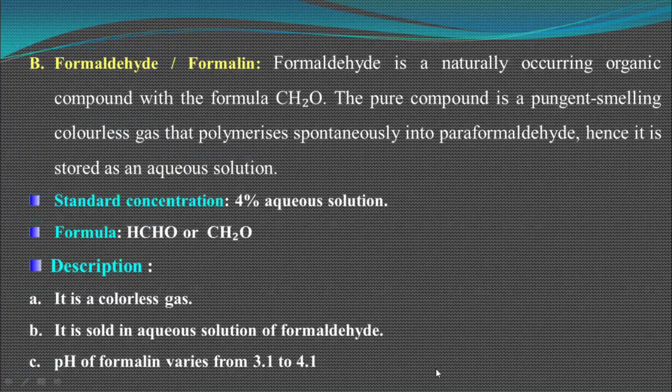The second fixative is formaldehyde or formalin. Formaldehyde is a naturally occurring organic compound. Its standard concentration is 4% aqueous solution. The formula of formaldehyde is that it consists of 1 carbon, 2 hydrogen, and 1 oxygen atom.